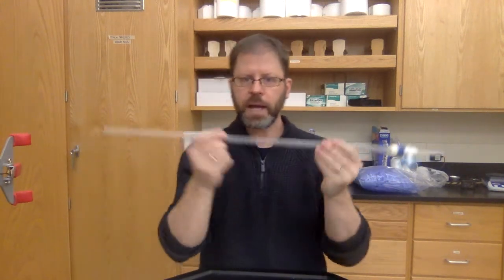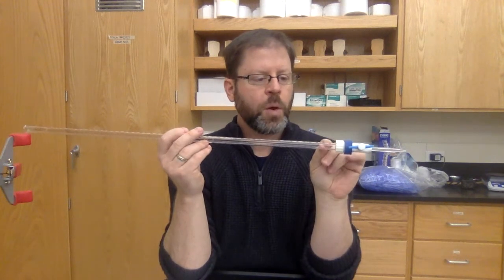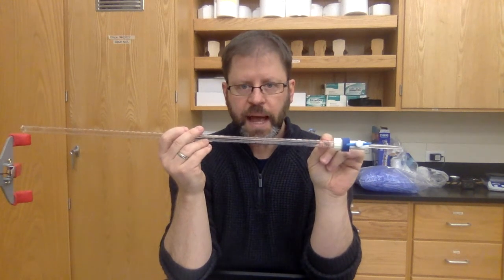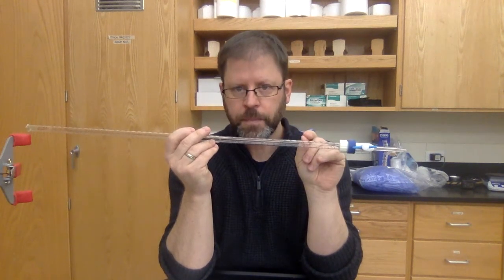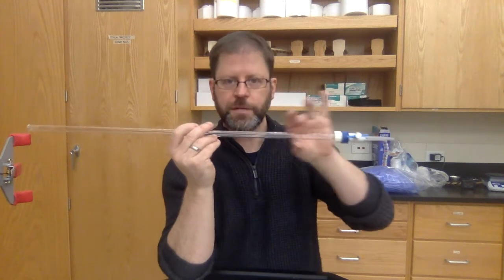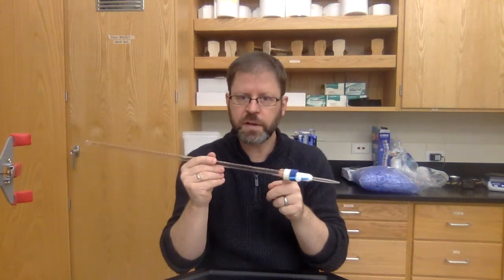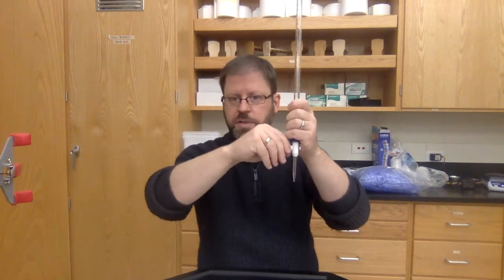And now here's lab practice. I'm going to prep this thing. So best practice would have you do a rinse of your titrant into this, and then you fill your titrant. Okay, this also helps you if there's ever a tiny little plug of water, which you might have because I just told you that you need to check to make sure this works.